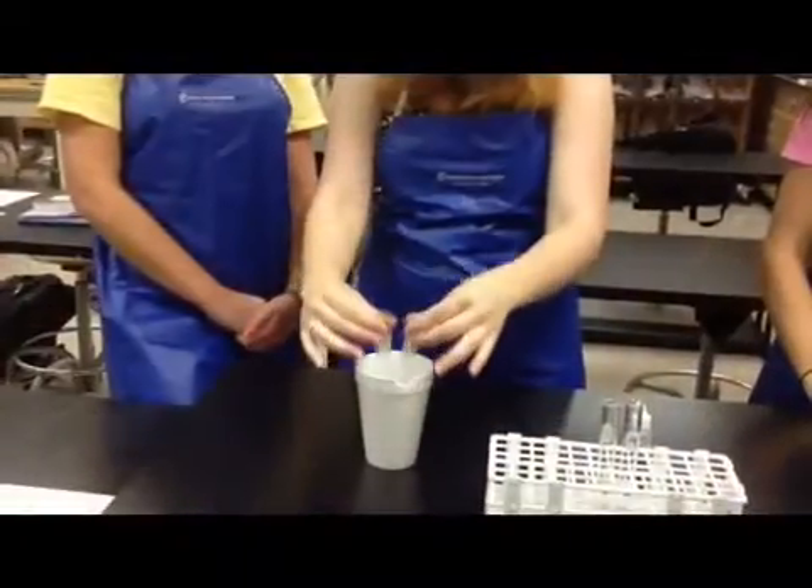We're done. Now let's look at our test tubes. One is yellow and the other is blue, just like it was when we started. That means that this one contains sugar water because it showed a reaction. This one is just the distilled water — it can't react at all.